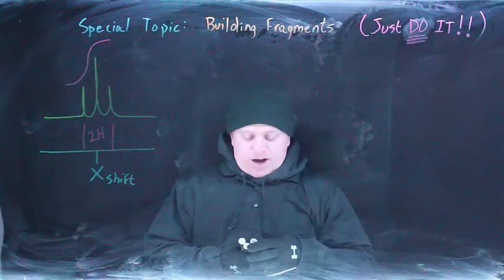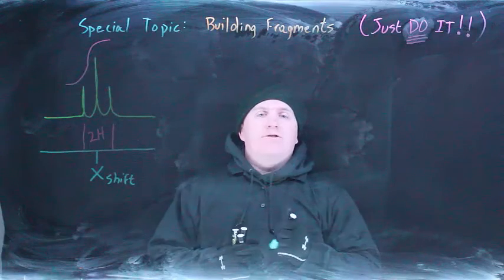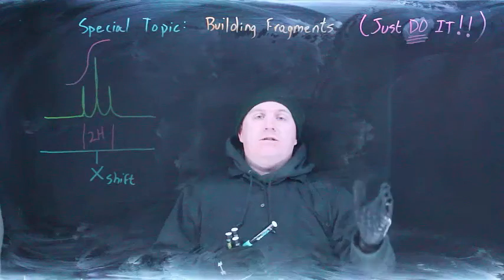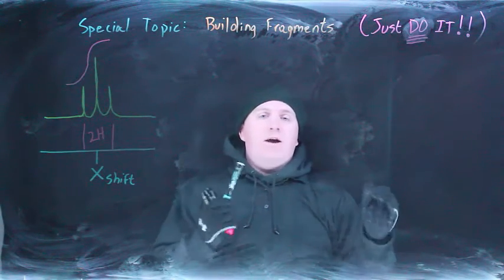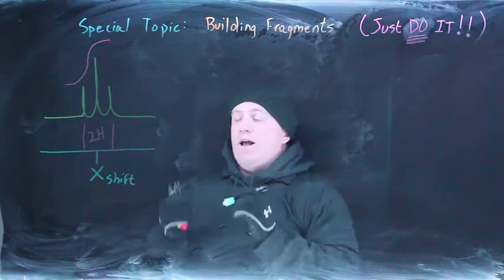So this is a special topic, and it's specifically about building fragments when you are trying to interpret NMR. And all I need to say here is you need to think Nike. Just do it. There is no better way of doing this. This is the systematic way of approaching compound identification. If you are doing it any other way, you're doing it the hard way, and there's no reason to.